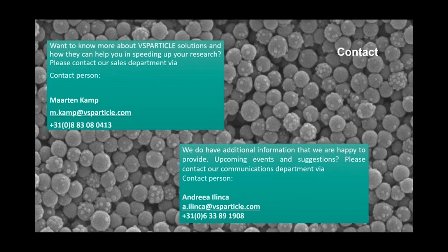Ravi from Specialized Instruments India says, how easy is it to change the electrodes? Can one easily change electrodes on site? Definitely. I think it takes, including the cleaning, half an hour or something to change the electrodes. It's 2 screws, 2 clamps. It's really easy. And if you have a problem with replacing the electrodes, I will come to you and help you with it.